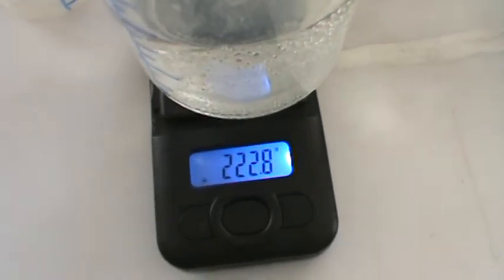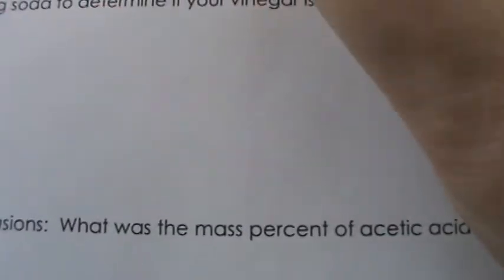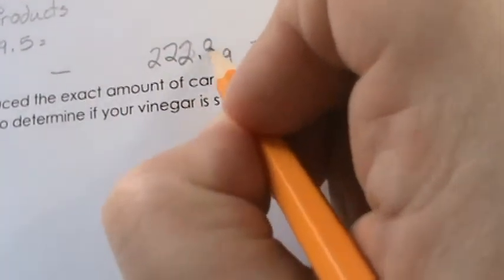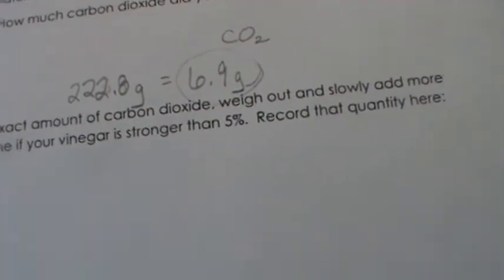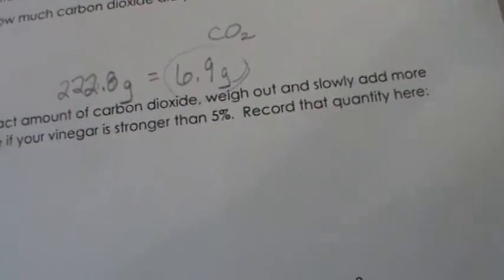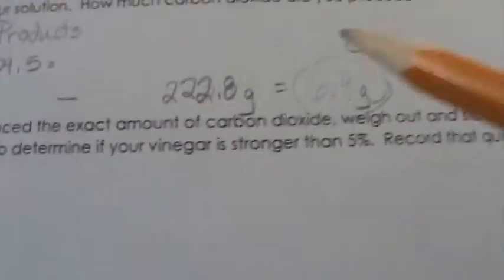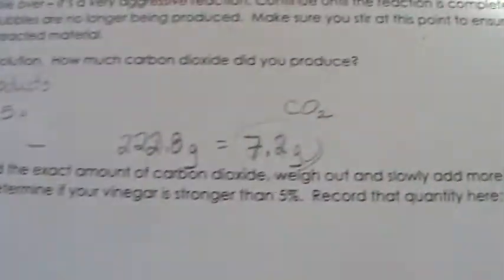It has. Look at that, 222.8. So, 230 minus 222.8, and we have now gotten 7.2.